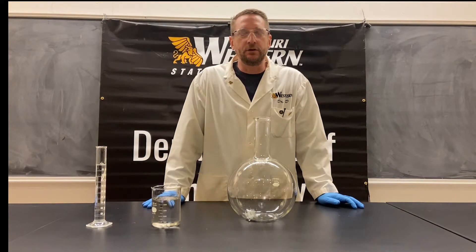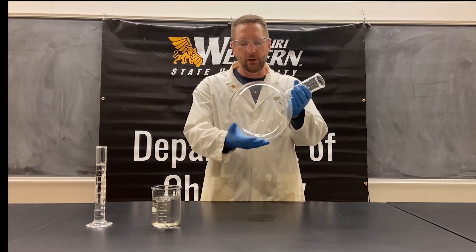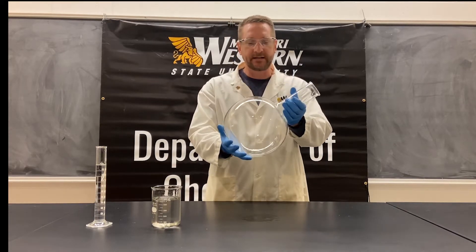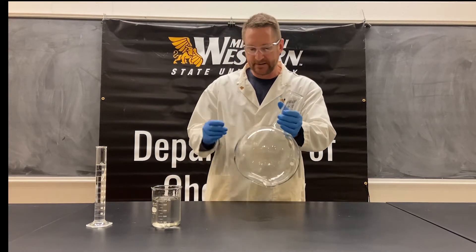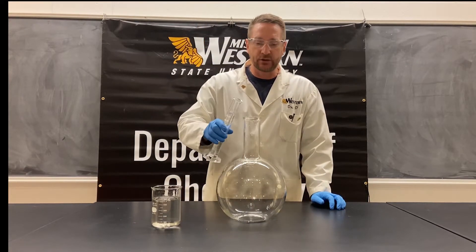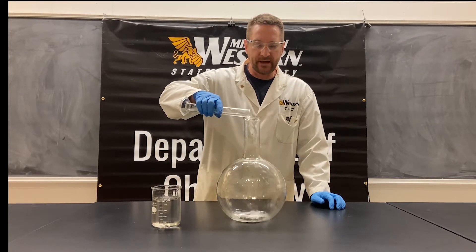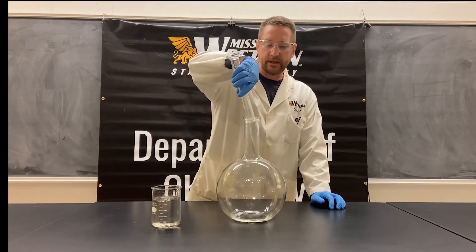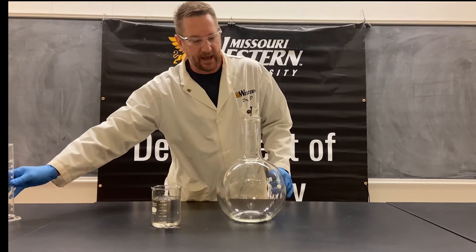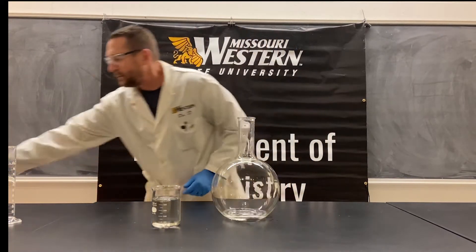The demonstration I'm about to do is the formation of a silver mirror, forming it in this big six-liter Florence flask. I'm going to start with some dextrose — dextrose is a reducing sugar, which is the reason we're using it. Essentially, we are doing a Tollens' test on the inside of this flask.